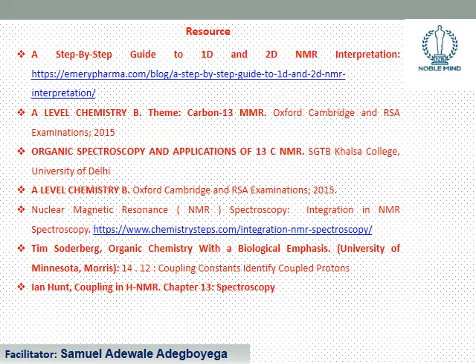The aspect of NMR that is left, as I placed on the previous slide, is that which you may read about in further studies. So, some 2D NMR experiments.